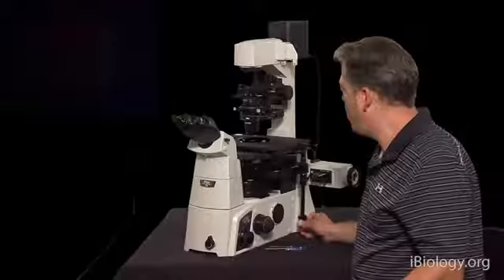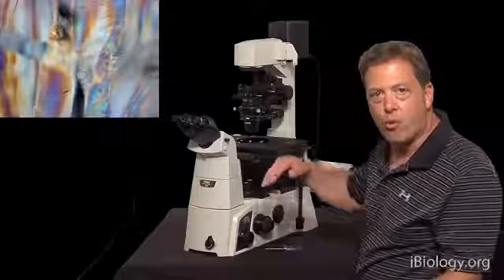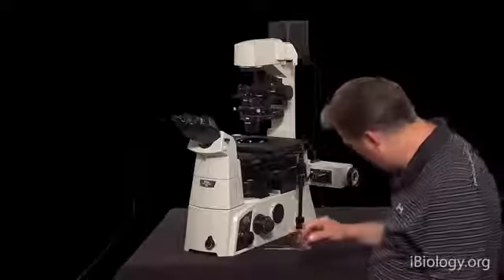And now when I put a specimen in place that's sensitive to polarized light, you can see, let me just touch up the focus there, like these paper fibers, these nice interference colors that are generated from the phase shift of the polarized light, because all of the waveforms are going in the same direction. Okay? And as we go off extinction, or we vary the amount of extinction, you can see the colors shifting on the camera. Okay? So that's the first step in differential interference contrast.